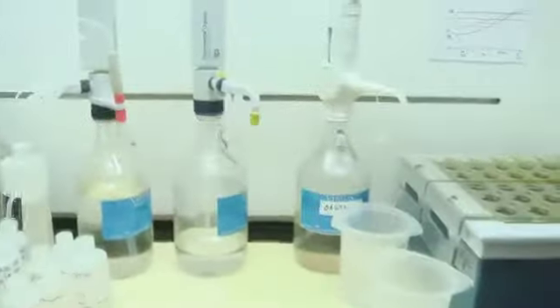Really good stuff. This is our auto sampler right here, of course. Some of my agitation systems. This is some of the racks of things we've got going on. Some additional equipment happening there. This is my face mask for the nitric acid digestion process, which takes place in here. We've got a hot block digester here. We've got some nitric acid. We've got some external standards of different metals.